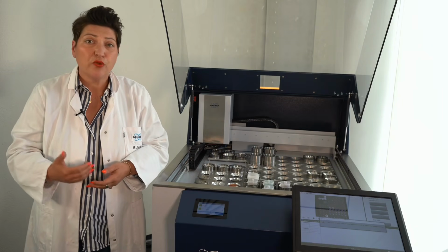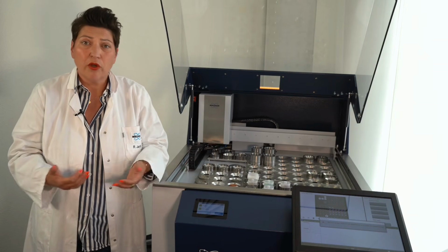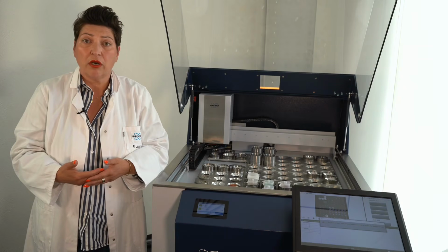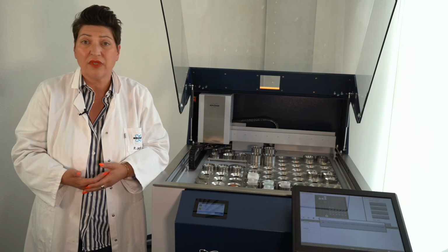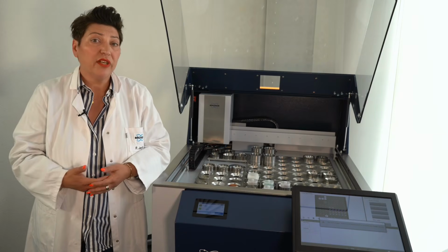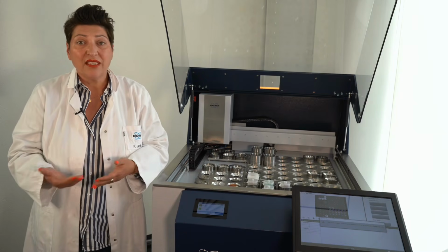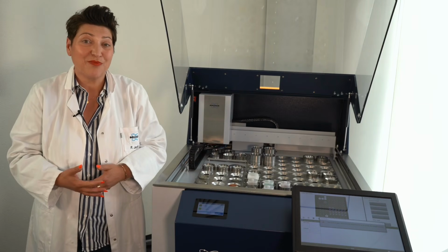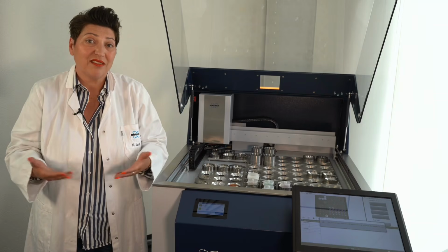If you're interested in really having lowest detection limits, for example, very low chlorine or heavy elements or really hazardous elements like arsenic or lead, maybe you have to improve a little bit the measurement parameters. In this case, you can set up calibrations, but quite often for these kind of materials, you do not have proper standards that you can use to set up your calibrations.